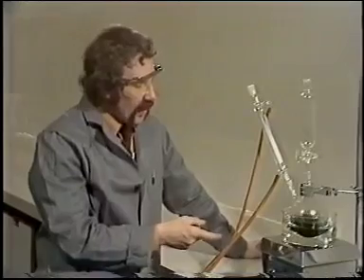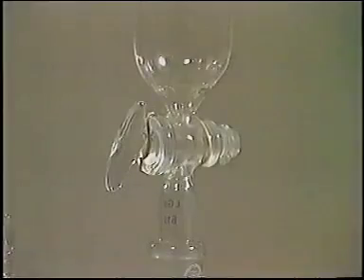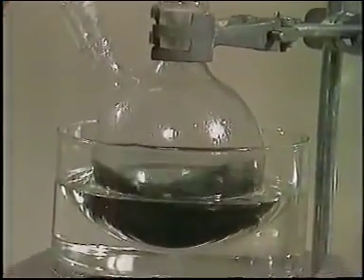This is where you expect to find the organic chemist, in the lab, doing an experiment. The reaction I was carrying out here was a simple oxidation. I dripped in benzyl alcohol from the dropping funnel into a hot stirred mixture of potassium dichromate in water.